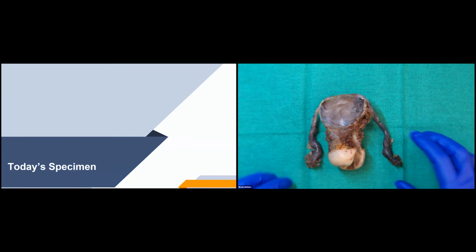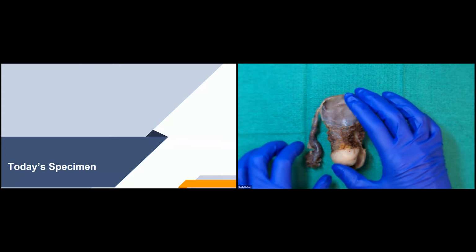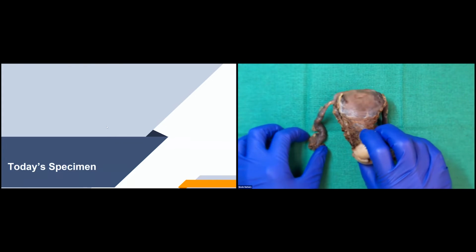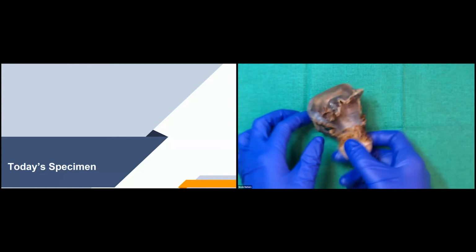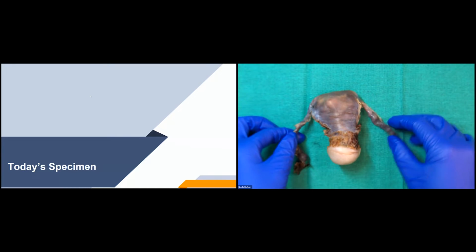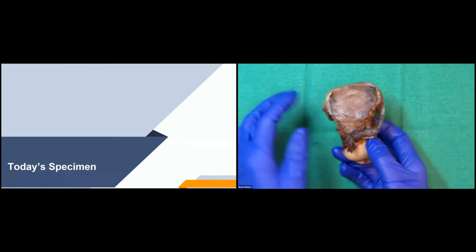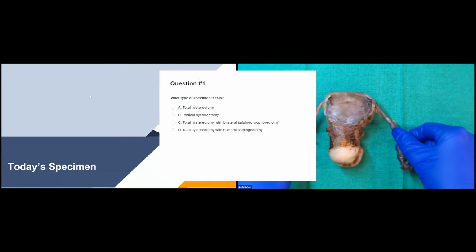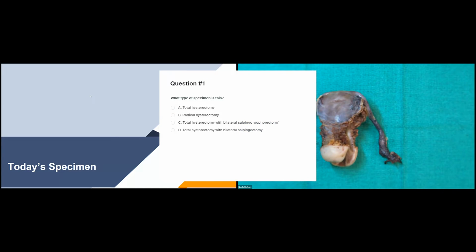Everyone, here is our specimen for today. I'll just move it around a bit so everyone can see it first. And then I'll put up our first polling question. So what type of specimen is this?